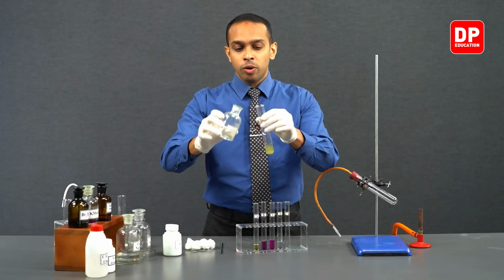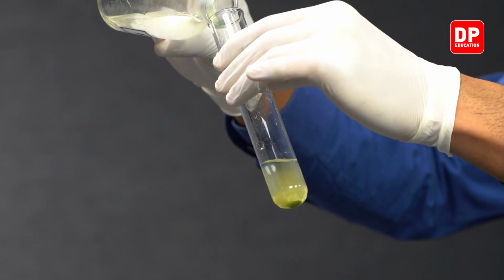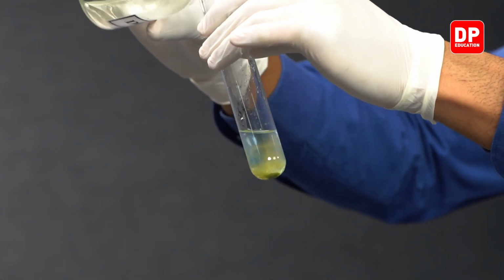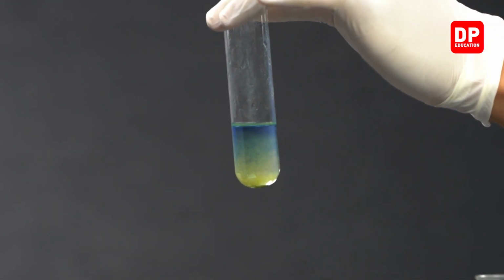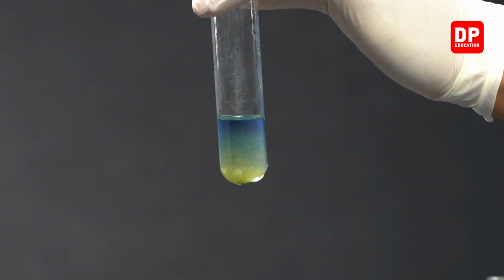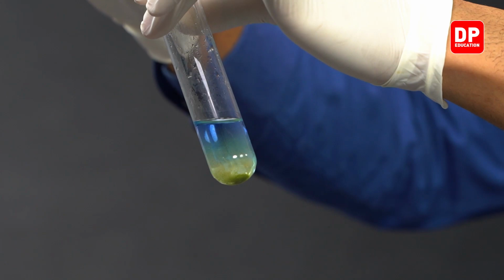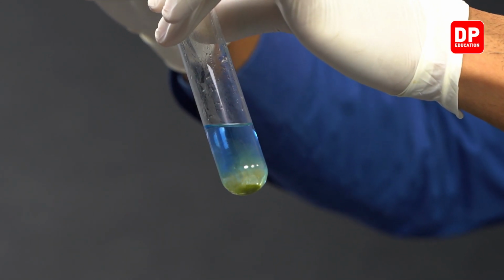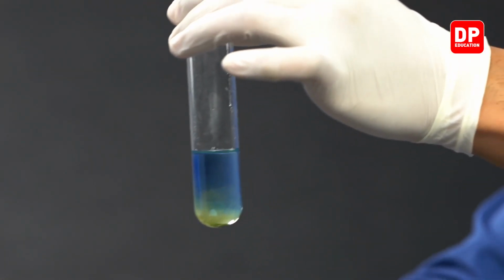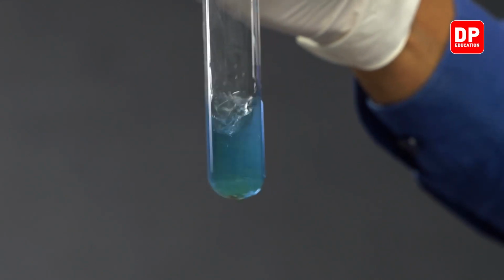And let's add a small volume of dilute ammonia into this boiling tube. You can see when we add dilute ammonia, the color is starting to change into a blue color. We'll add a bit more ammonia. And let's mix it all really well.